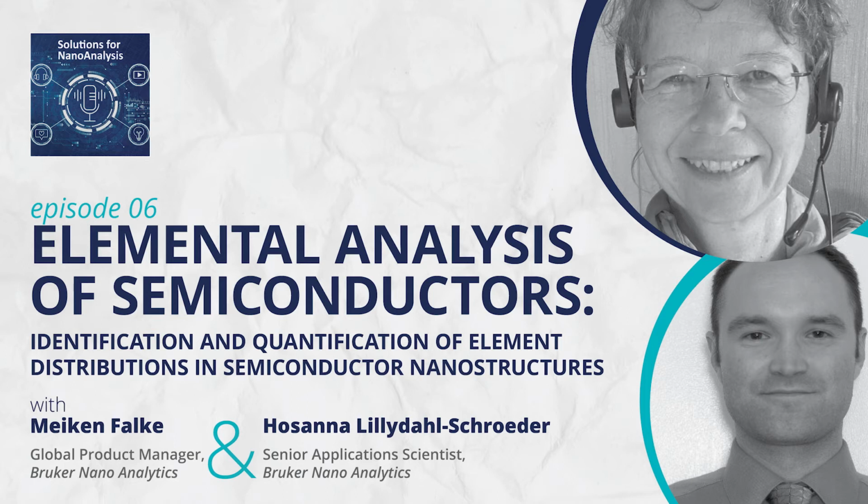And then there is more to the semiconductor industry. It's not just the functional materials which are of interest, but also other things which might cause device failure and need monitoring and investigating. For instance, remains of the etching process, like fluorine from hydrofluoric acid or chlorine. And it's important to see where they are and if they have any unwanted effects. So this results in a mixture of light and heavy and medium-sized elements. And as I said, EDS is really good at tackling those.